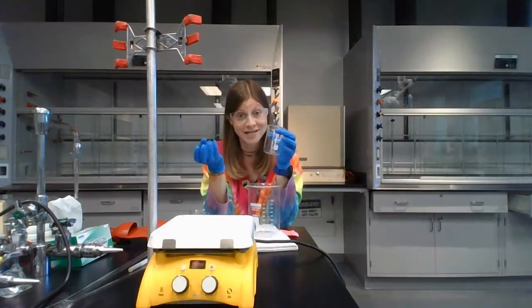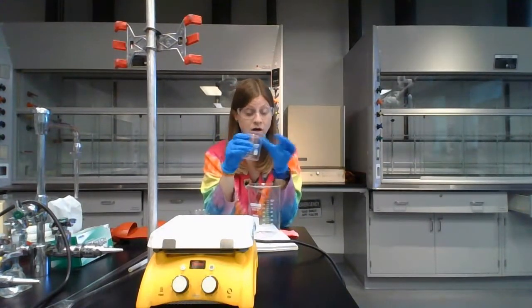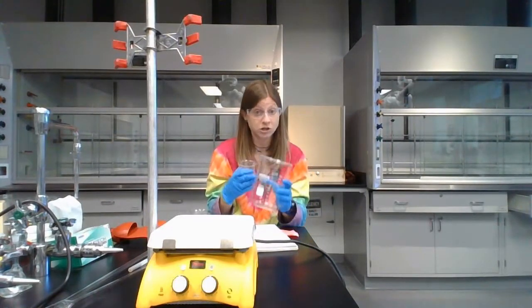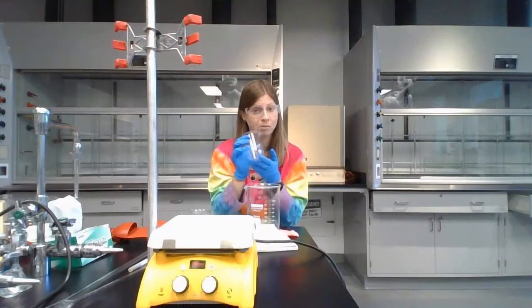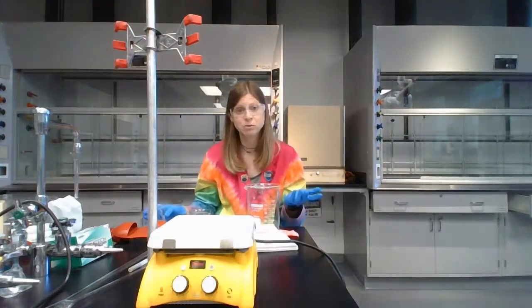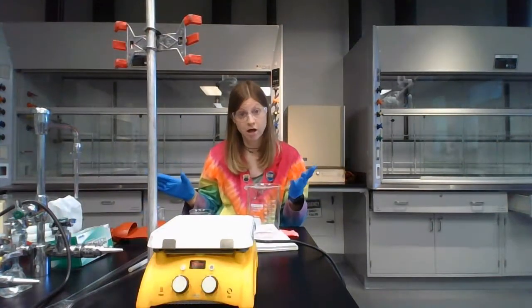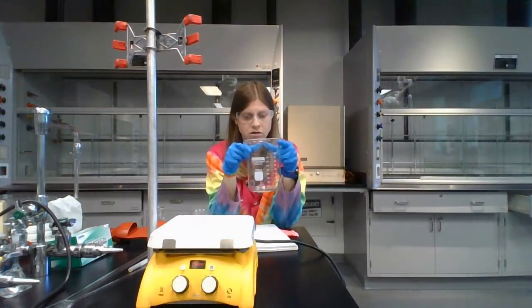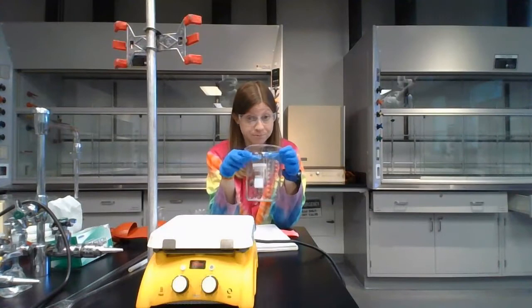So you're going to take more oxalic acid and pour it into your beaker and dump that mixture into your waste beaker for all your mixtures until there's no more purple remnants in your beaker. At this point, all your chemicals should be gone, except your 1 liter beaker filled with all the mixtures.